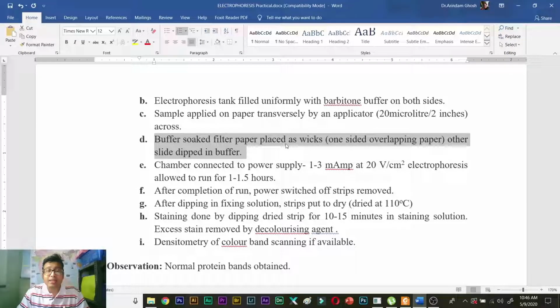Over here again, it might be confusing to you before you see the exact video. Sometimes we pre-stain the samples. If we stain earlier, we don't need to stain it further, we will directly destain it.